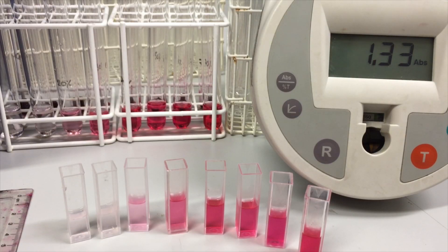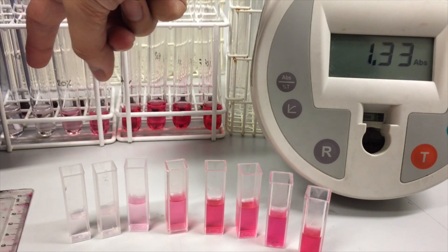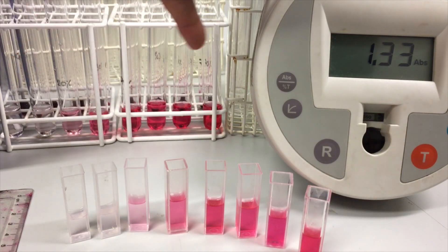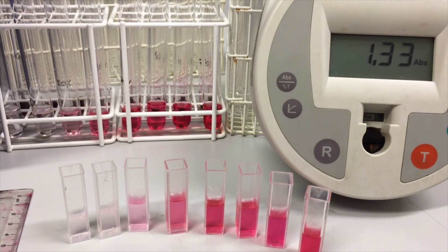So it might be useful at this stage to just recap on how we set this experiment up, what things we controlled and what things we varied in order to come to a conclusion about the effect of alcohol on membrane structure, membrane integrity. So easy thing to start off with, we looked at what effect alcohol would have on membrane structure by initially having a set of solutions of alcohol in water and increasing the proportion of alcohol in the different solutions. So we went from zero, i.e. just water to 70% alcohol and in that alcohol we placed some beetroot assuming that the beetroot contains a dye and that that dye would be released if the membrane structure was negatively affected.